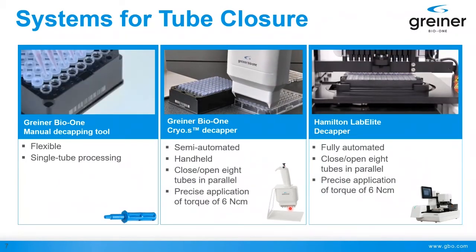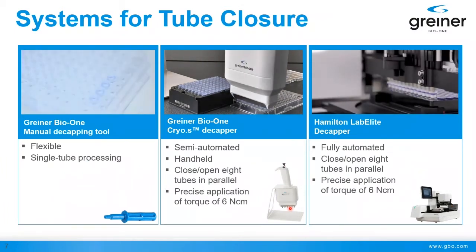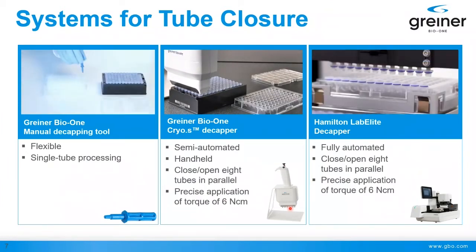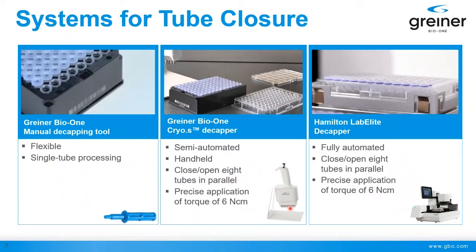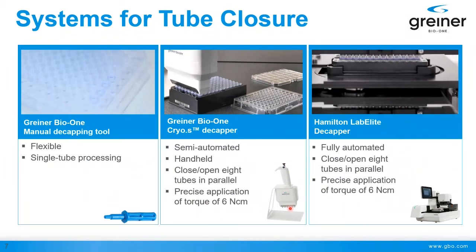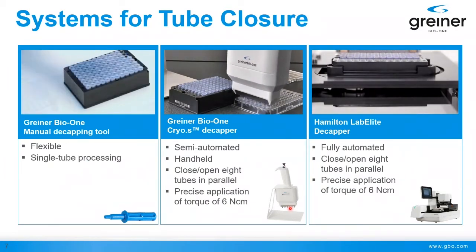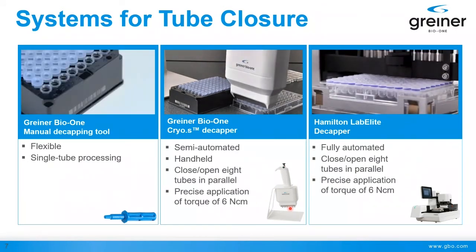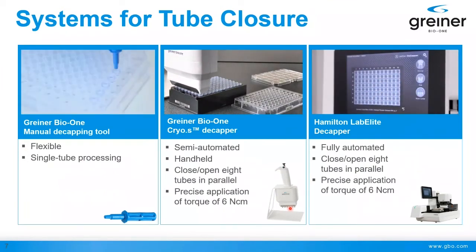And this brings me to a common best practice that I can really suggest: if you want to store longer, say a year, 2 years, or really look at long-term storage, which can be 10 or 20 years, then there is a phenomenon like water evaporating out of your tube. When we were first confronted with this, we were surprised because we thought at these low temperatures, this doesn't happen, but it's happening.